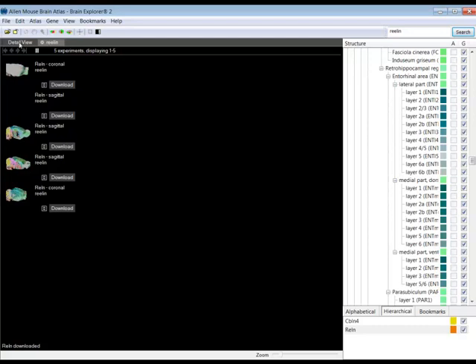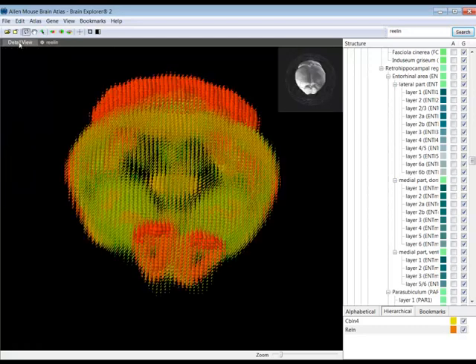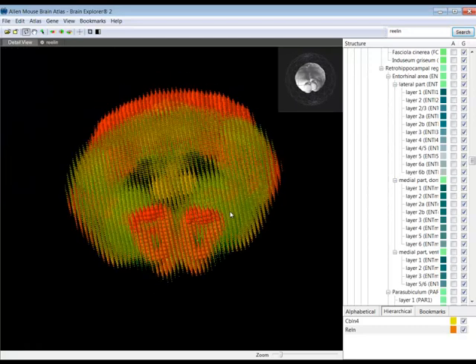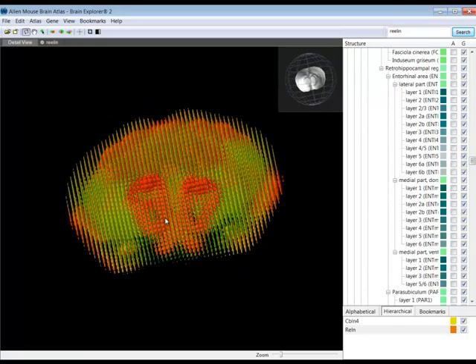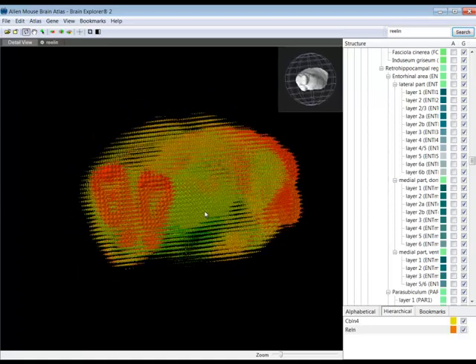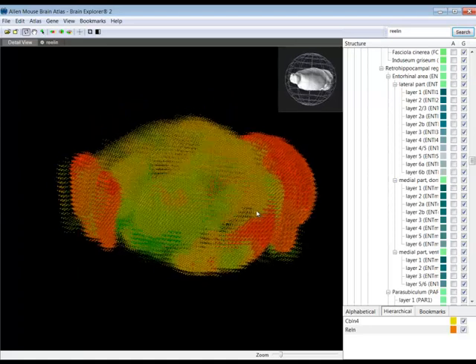Again, choose an experiment done in the coronal plane, and then go back to the Gene Expression view by clicking on the Detail View tab.